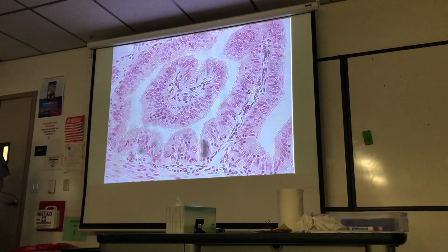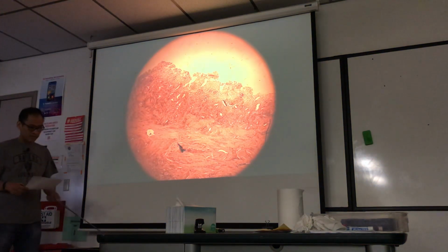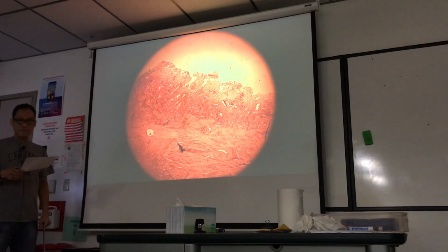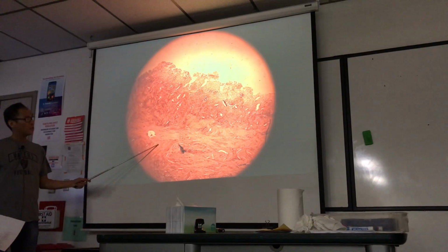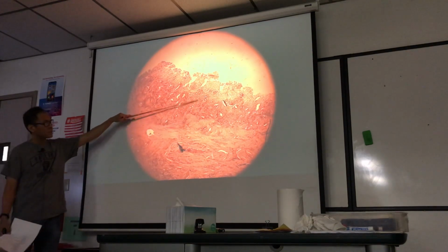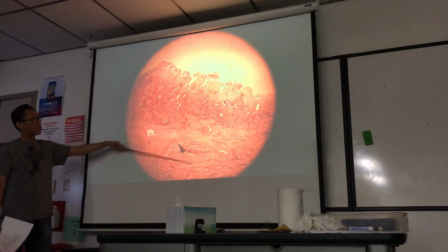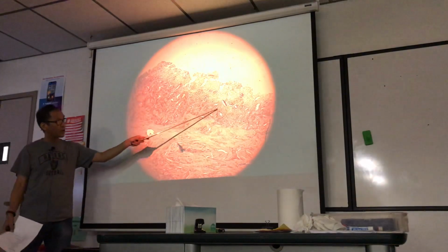So we're going to move away from the oviduct and go to the uterus. This is the proliferative phase. If you study the slide, it will say follicular phase section, because that's what the ovary is doing while you're in the proliferative phase. You should be able to tell this is proliferative phase, and that from here to here is endometrium. Therefore, from here to here is myometrium.